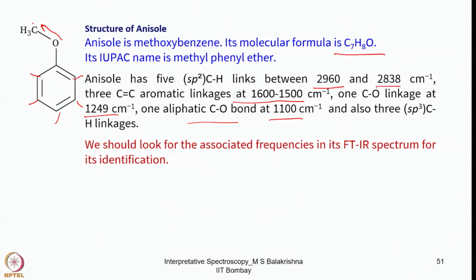So these are the bonds. You can anticipate some bands in the IR spectrum. So now we should look for the associated frequencies in its IR spectrum for its identification. Now we have identified, from the prior information we have about the different stretching frequencies and other things.